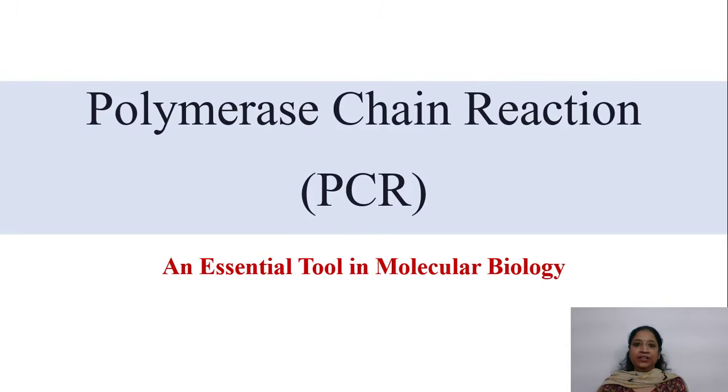In this video lecture, I am going to discuss one of the most transformative innovations in molecular biology, polymerase chain reaction or PCR. While the name might sound complex, PCR is essentially a method of amplifying DNA. Think of it as a molecular photocopier that takes a tiny sample of DNA and multiplies it exponentially so we can analyze it in detail.